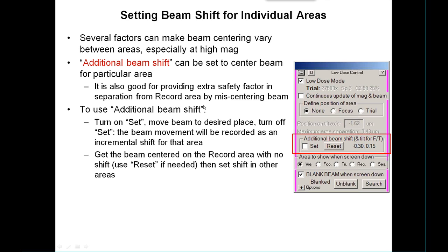We have the ability to shift the beam around individually into different areas. The reason is that various things make the beam centering differ between areas, especially at high mag. There's a capability called additional beam shift to set the center of the beam for a particular area. You can also use it to mis-center the beam away from the record area in the trial and focus areas if you want to.